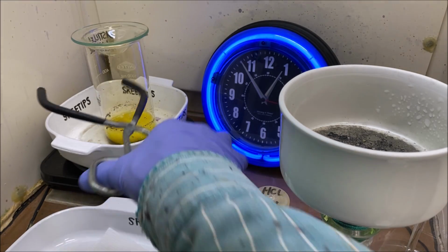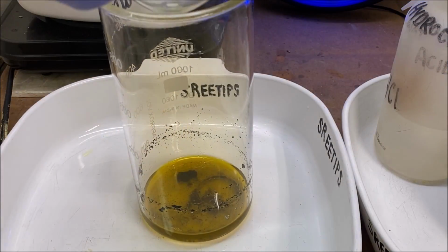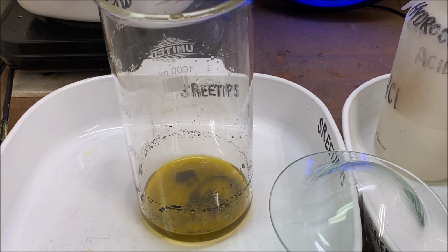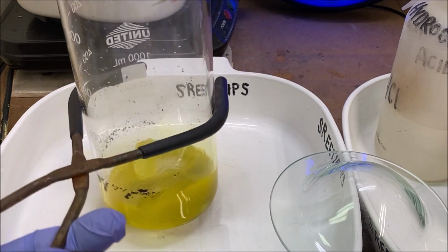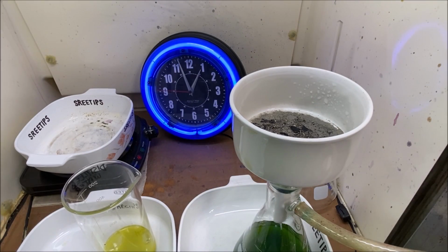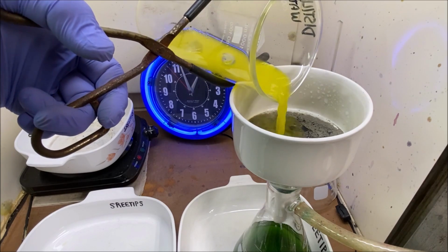I think we've got everything that we're going to get to go into solution in this beaker. So now we're going to pull it down off of here, let it cool down. Still a few solids in here, but I'm not going to fight with it anymore. What we'll do is just add a little bit of ice to cool this down. Go ahead and add this to the filter now, and we'll just gather up any remaining solids in here and let them commingle with the solids that are already in our filter.